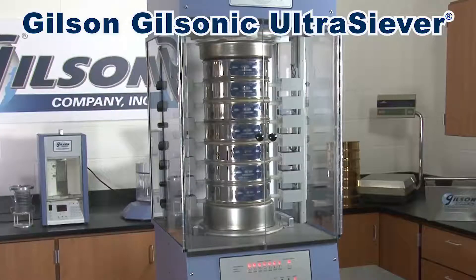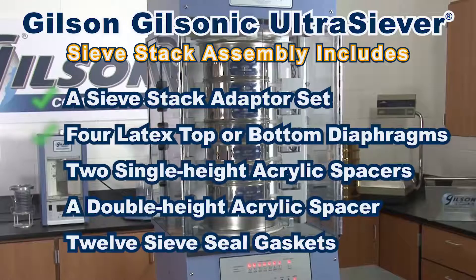Components for the sieve stack assembly are supplied with the Gilsonic Ultrasiever and include a top and bottom latex diaphragm, sieve stack adapters that seal the sieve column, and polyurethane sieve caskets that help maintain maximum sonic efficiency.